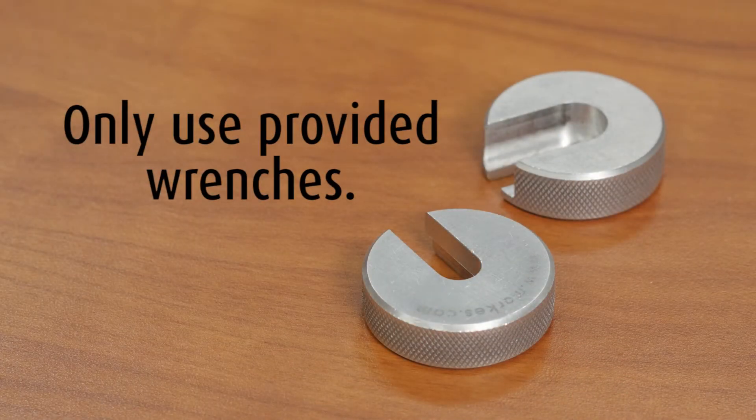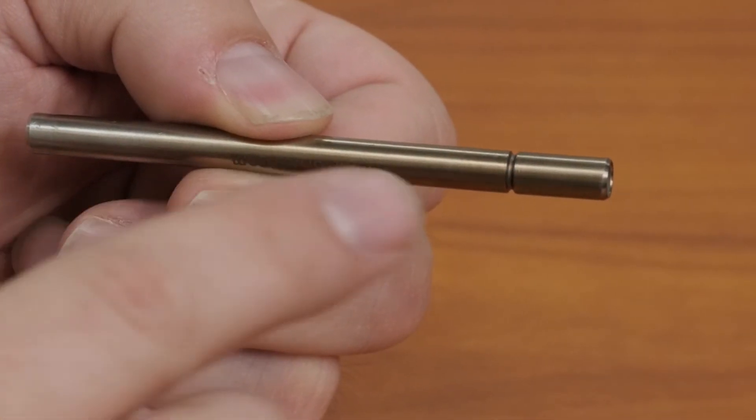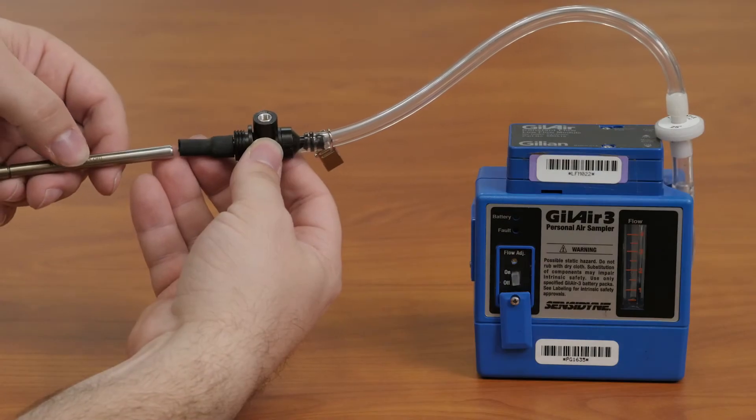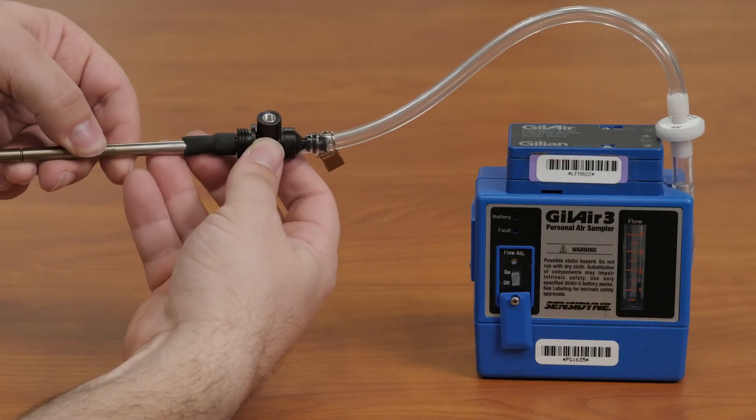Do not utilize your own wrenches, as this may invalidate your sample. On each tube, you will see a notch indicating the inlet of the sampling media. Place the media into the sampling tubing with the notch pointing away from the pump.